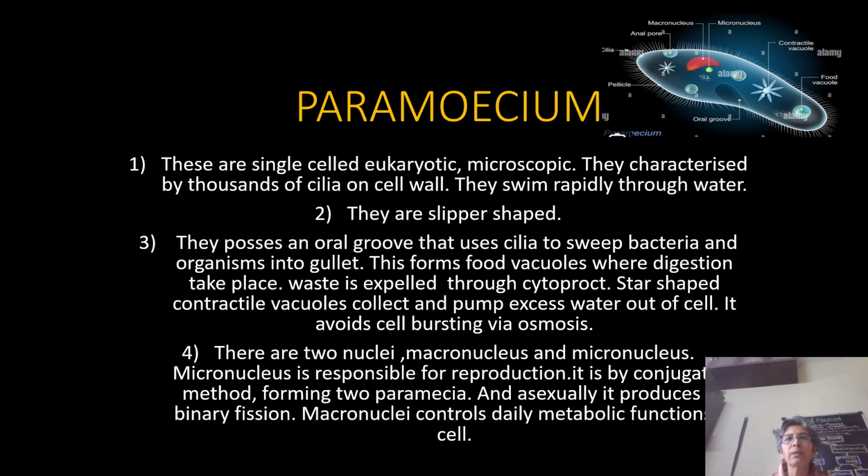These are single-celled eukaryotes, microscopic and characterized by thousands of cilia on the cell wall.